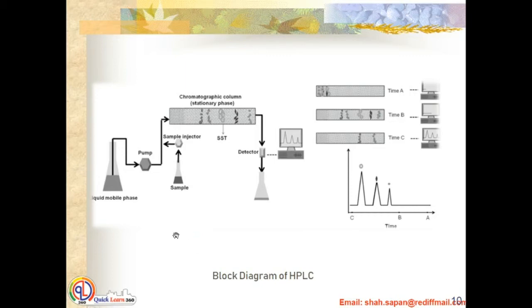Which conditions? This includes the type of mobile phase, temperature, the column involved, and the pump flow rate. All these factors have to be considered for the positioning of this peak, and this positioning we call the retention time. So RT is specific for a particular drug under particular conditions. So this is a very important instrument.